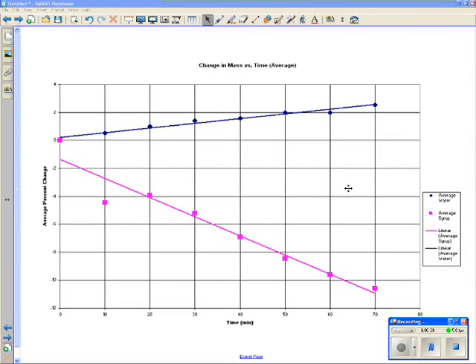Once you have completed calculating your percent change in mass on your sheet, you want to find this graph that is part of the packet that you were handed out. This is generated from our class data. And just a quick discussion of what we've got here. We have the eggs that were in syrup and what happened to their mass. You find the 0 line here, which tells you that these eggs lost weight.